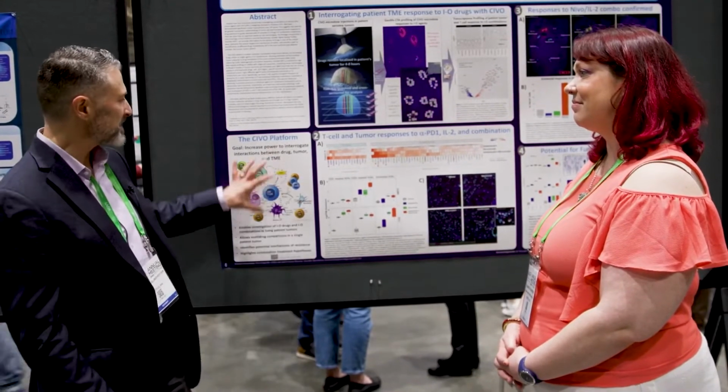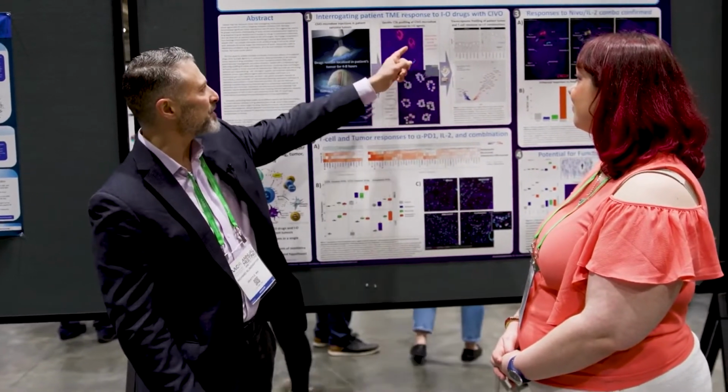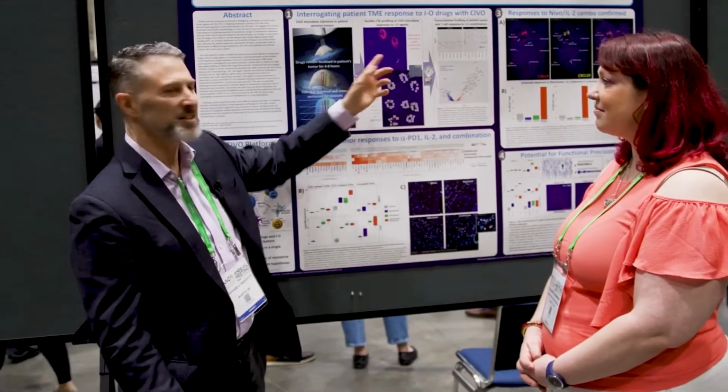And I'd say there you probably want to use more advanced mouse models that are immune competent, so that you can still capture the complex interactions that occur between multiple different components of the immune microenvironment once a drug hits that environment, and compare drug exposed versus unexposed. And again, I think that's the beautiful application of combining what we do with the Nanostring technology. It's layering drug exposure on top of spatial biology and saying what happens when you have a drug combination versus a control region versus a single agent, and making those comparisons in a very spatially defined way.